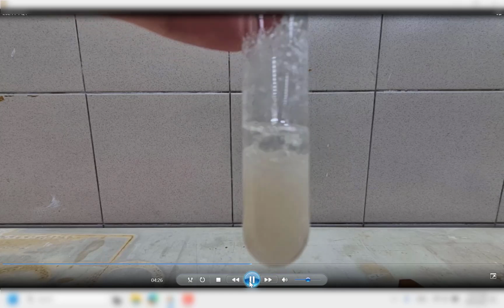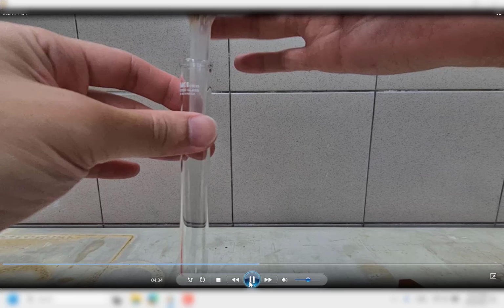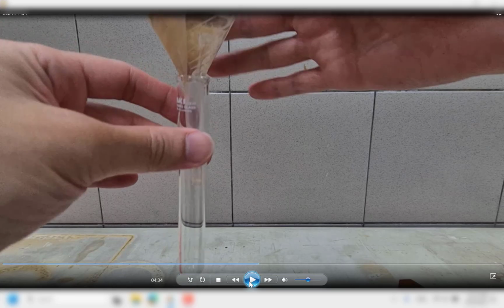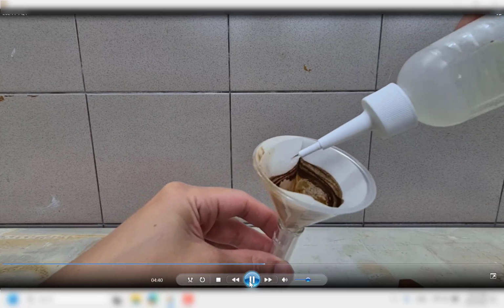Okay, so swirl, then you probably get brown PPT. Sorry, it's jumping around, but you get the gist of it. So now we are going back to the earlier part where we're going to do filtering. Okay, so this dilute nitric acid, so just add in.